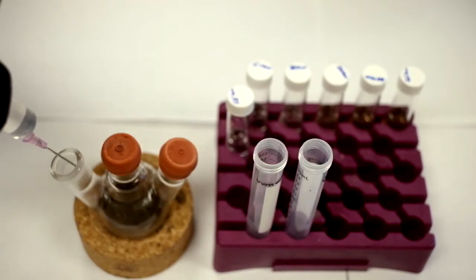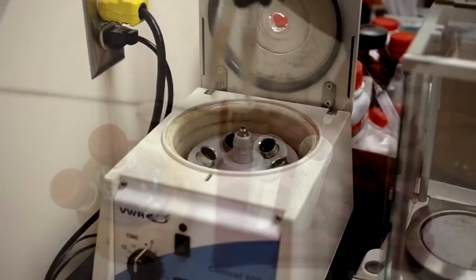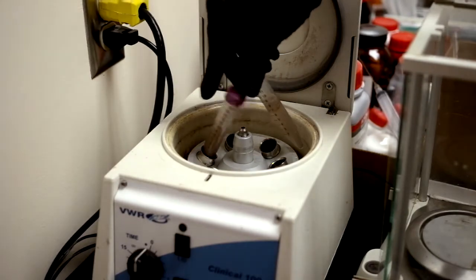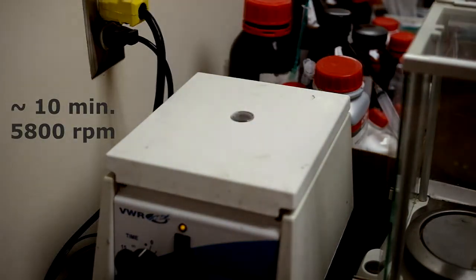Once the reaction flask is cooled to room temperature, we add 12 ml of ethanol and split between two centrifuge tubes, topping each off with ethanol. Shake the centrifuge tubes to mix and place into the centrifuge. Spin for about 10 minutes at 5800 RPM.